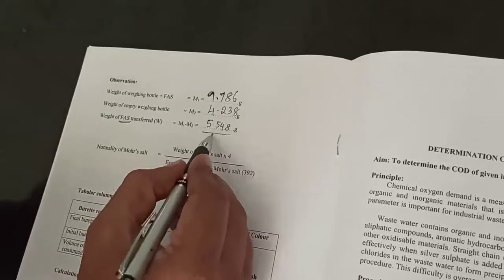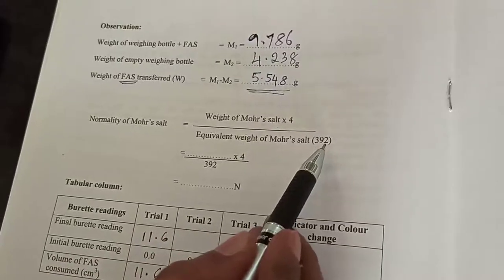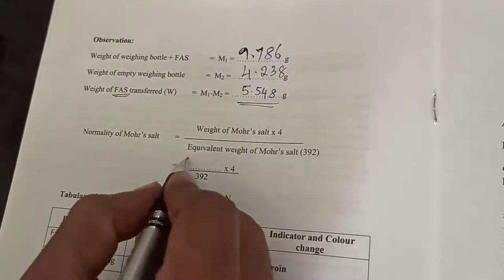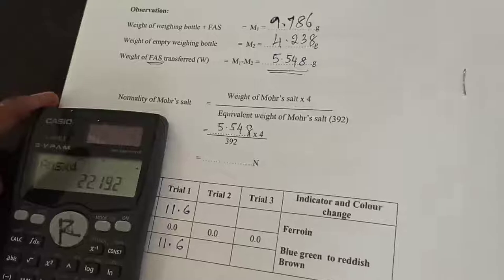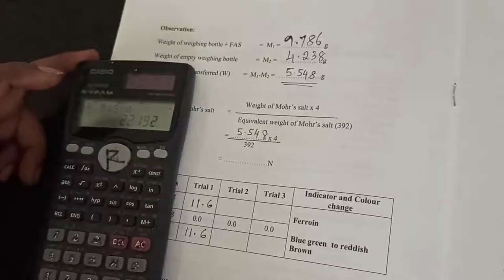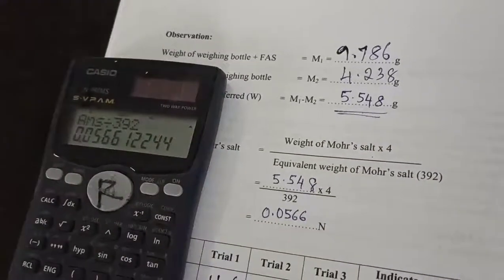From the weight of FAS, calculate the normality of the FAS solution. Normality of Mohr salt solution equals weight of Mohr salt taken multiplied by 4, divided by the equivalent weight of Mohr salt (392 g). The weight of Mohr salt is M1 - M2 = 5.548 g. So: 5.548 × 4 / 392 = 0.0566 N — that is the normality of the solution prepared.